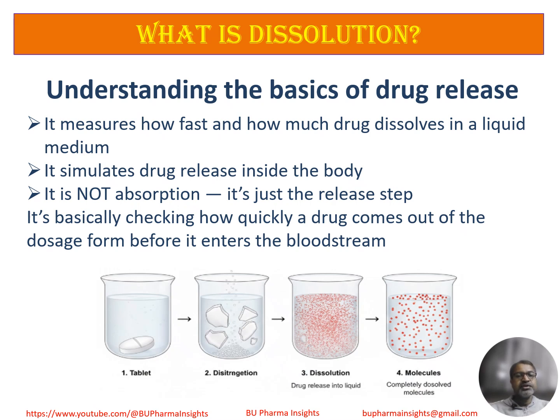Actually, dissolution tells us how fast and how much of the drug is released from its dosage form into liquid medium. We perform dissolution testing to simulate what happens in the stomach or intestine using carefully selected media, temperature, and agitation that mimic in vivo conditions.